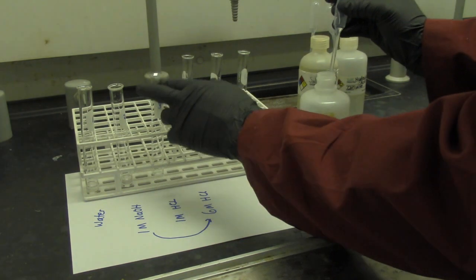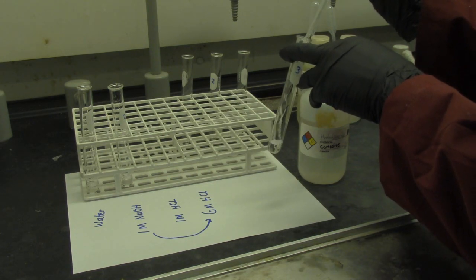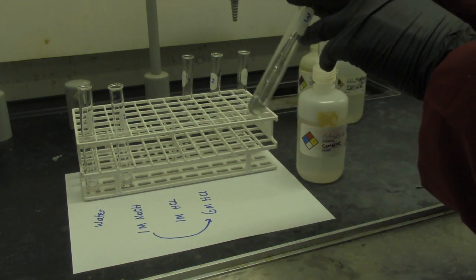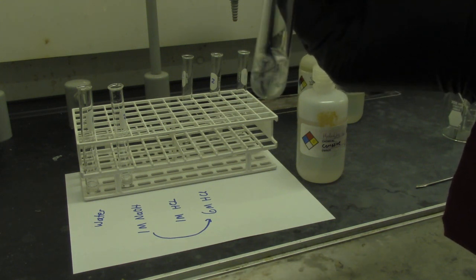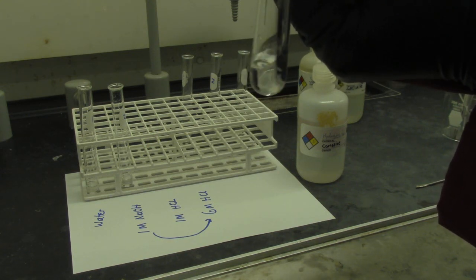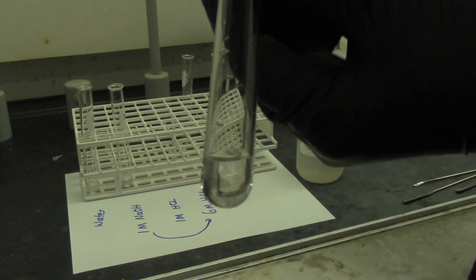To the third test tube, I add 1 molar hydrochloric acid and stir for 20 seconds. Note down the observation.